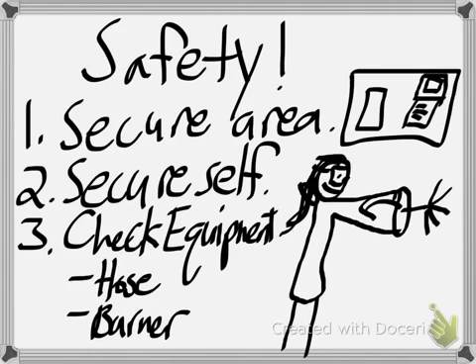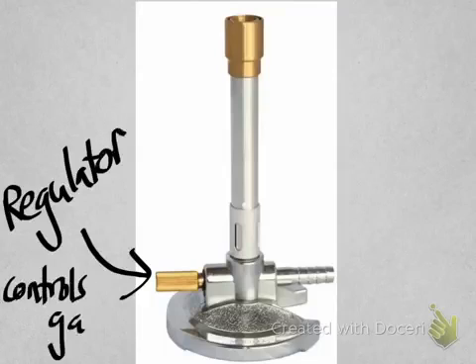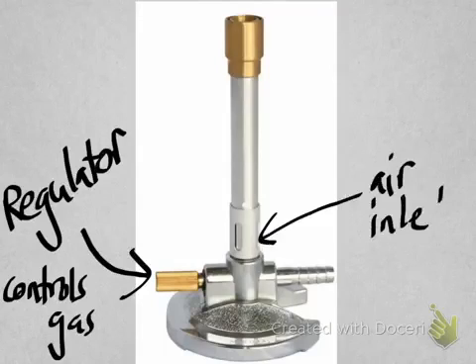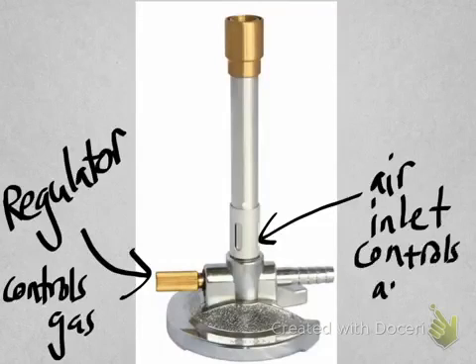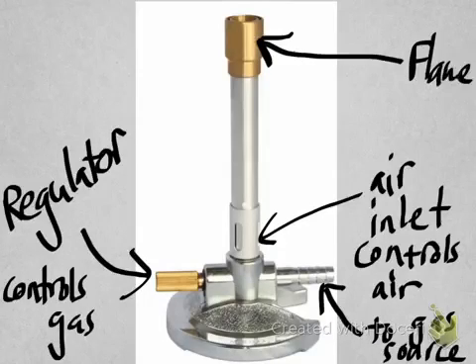The third step is to check your equipment. Make sure that your hose is in good shape and make sure all the pieces of your burner are where they need to be. We have a regulator which controls the amount of gas that gets let into the burner, an air inlet that controls the amount of air that gets into the burner, and then a tube that leads to our gas source.